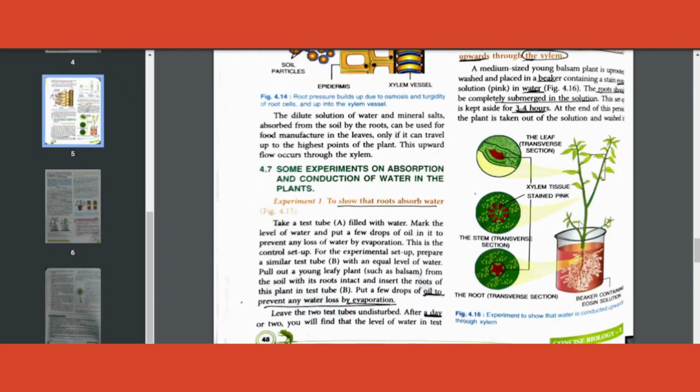After some time, take out the plant. Take a cross section of it, that is, cut off the plant over here. Make one more cut so that you get a tiny thin cross section like this. Okay, this part you've taken out like this. What do you see? You see that every other part of the cross section that you are taking will be colorless except for the place where the colored water ran through.